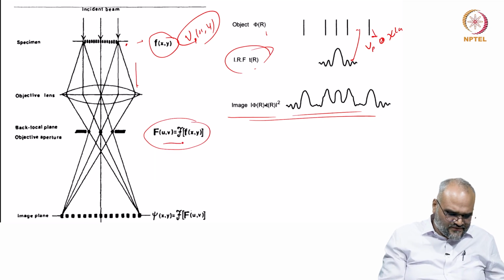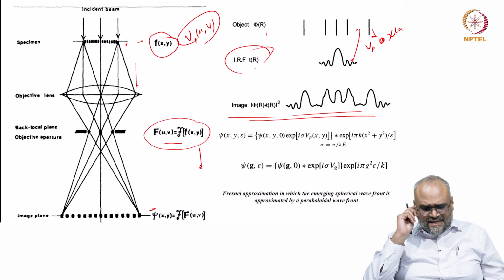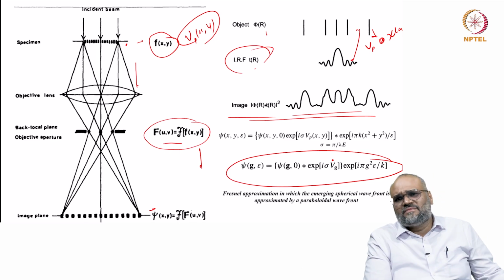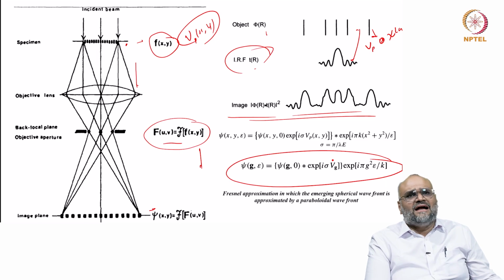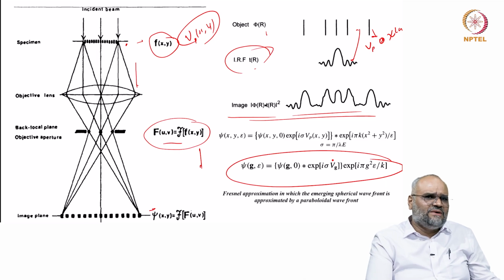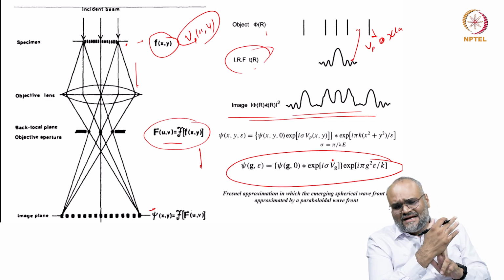If I look at what I record at the back focal plane, it is related to this information through a Fourier transform, and what I record at the image plane is again an inverse Fourier transform of this. So, from all these you can summarize that the information you record for an exit wave is given by a function like this, which is strongly dependent on the thickness, the defocus and the lens aberrations. By minimizing the spherical and chromatic aberrations, your aberration corrector actually breaks the resolution barrier. This is imaging with parallel illumination, whether it is bright field, dark field or high resolution imaging.